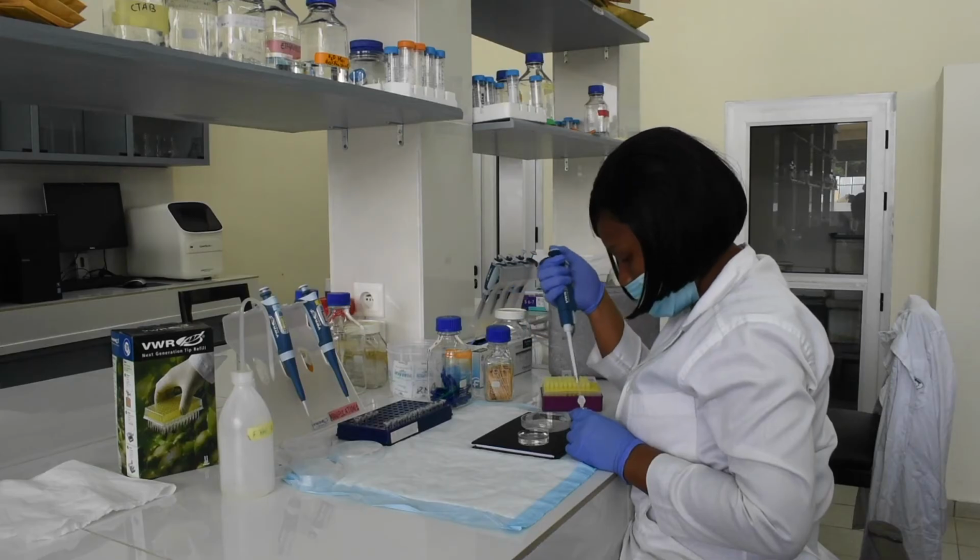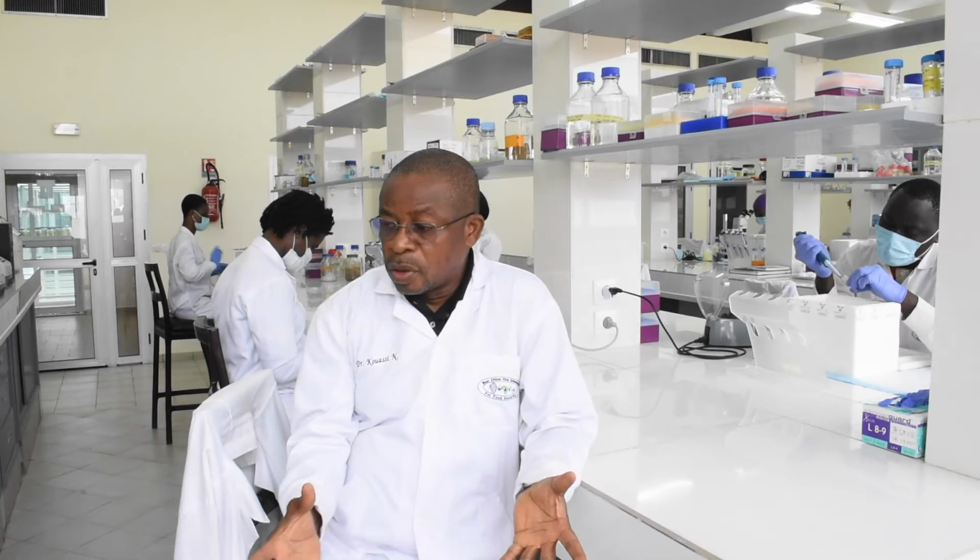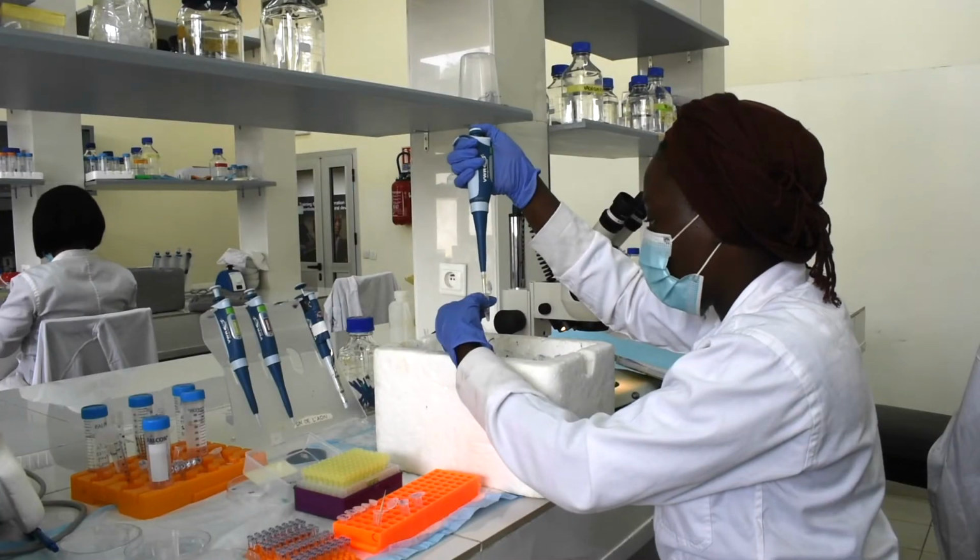After we have some DNA amplified, we can clone directly the DNA that we got, the amplified fragment. We can clone them in a vector and then send them for sequencing. We also do amplification using the RCA method, which is rolling circle amplification, and so on. We have a lot of techniques that we can do here.